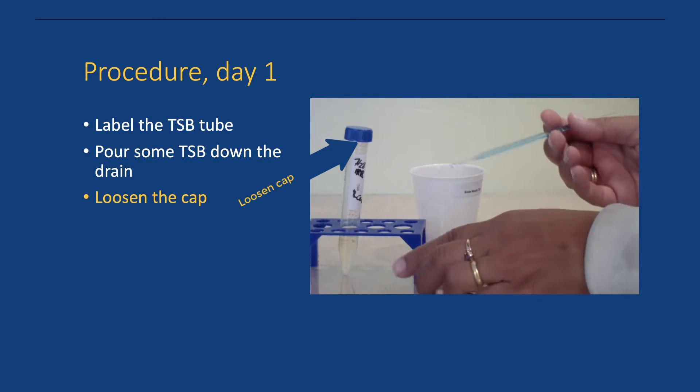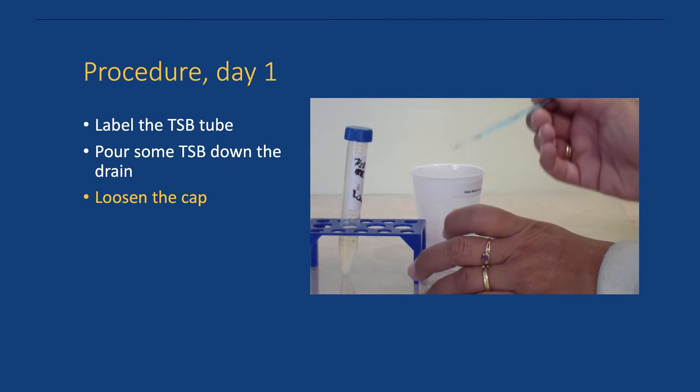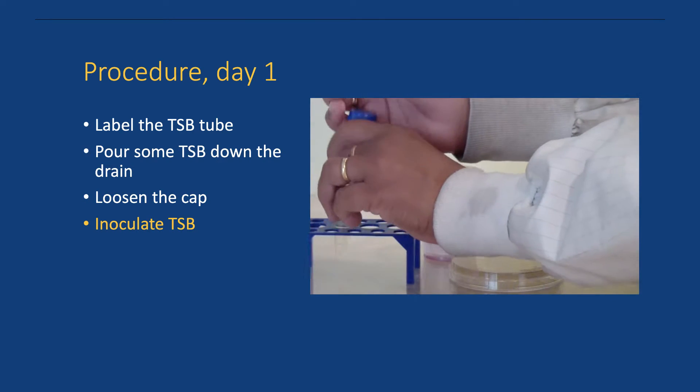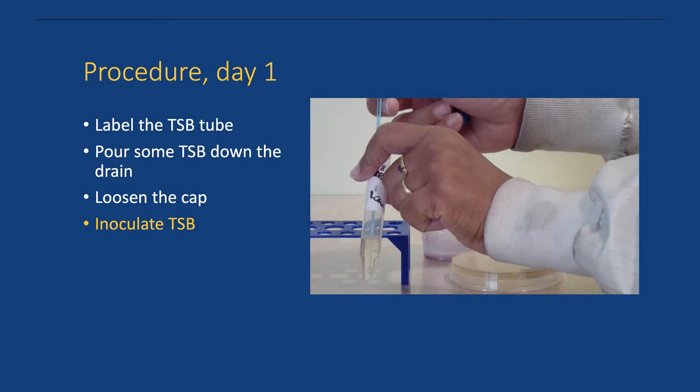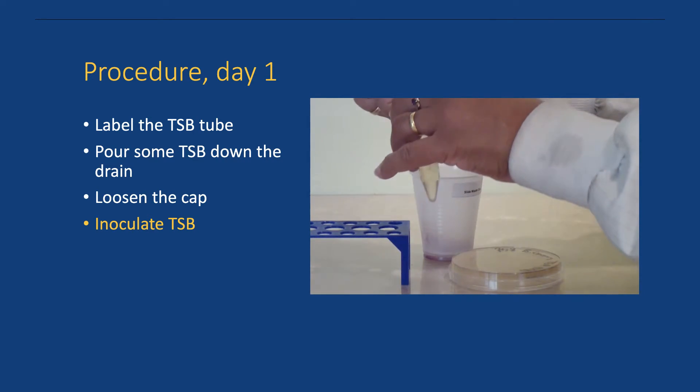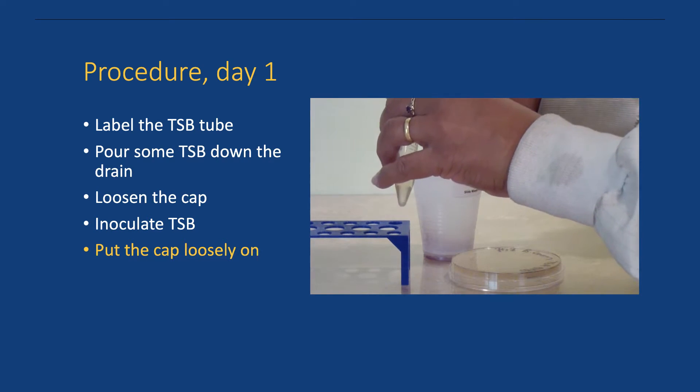Loosen the cap on the TSB tube. With an inoculation needle or loop, touch a bacterial colony on a plate. Be sure to touch only one colony. Inoculate the broth and replace the cap loosely to allow air exchange.